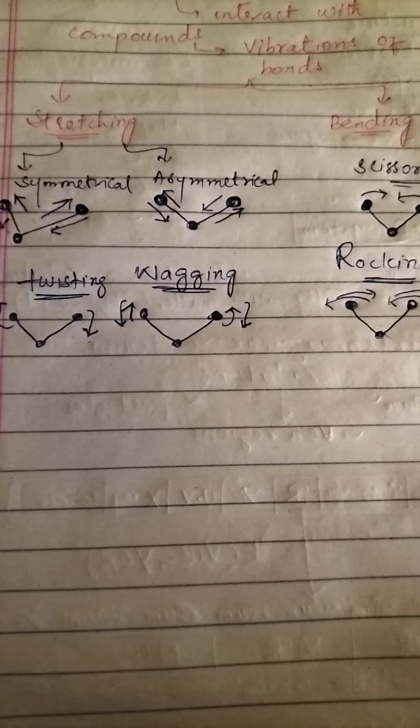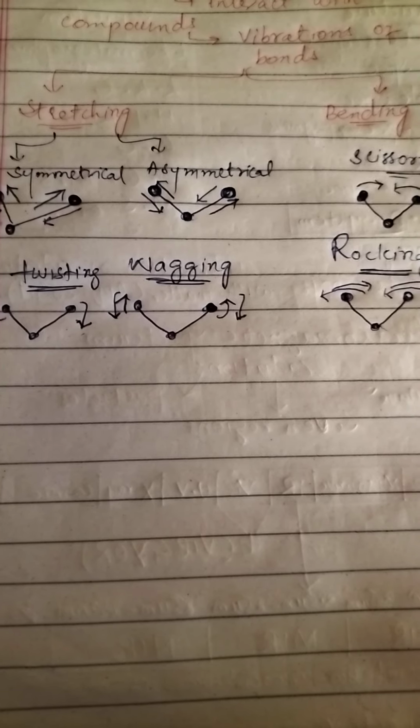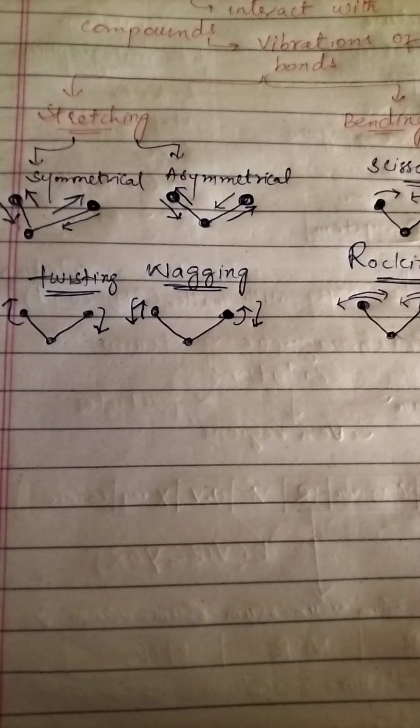These are the vibration modes. And how are the bonds vibrated?